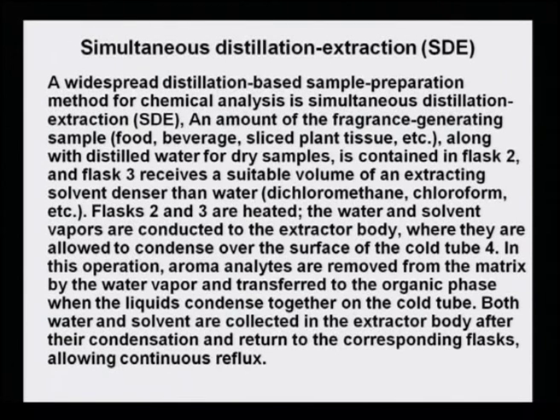Both water and solvents are collected in the extractor body after their condensation and returned to the corresponding flask, allowing continuous reflux. So, what happens is, in this particular type, that there is water distillation helping in the distillation, then there is an extractor in the organic medium, and both the vapors are then being transferred to a cold tube. So, the vapor actually condenses in the cold tube, whereas the carrier water solvent and the organic solvent get condensed in their respective flask.